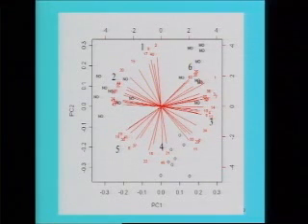16, 21, 22, 45, 33, 11, 29 and so on. Okay? So this is a very important display, the biplot. It tells us the grouping among observations, grouping among variables, and interrelation of observations with the variables. So, a very nice mathematical technique, singular value decomposition, helps us to display the group of genes and their relation with the various types of samples under study.